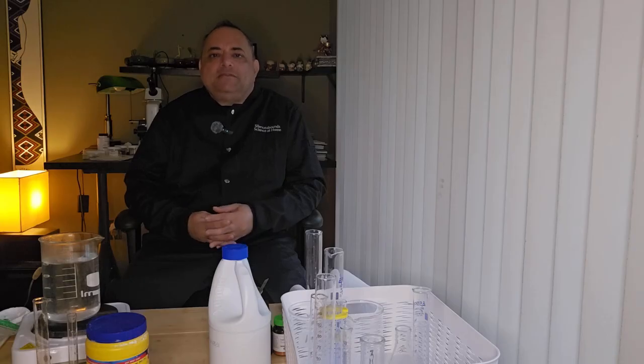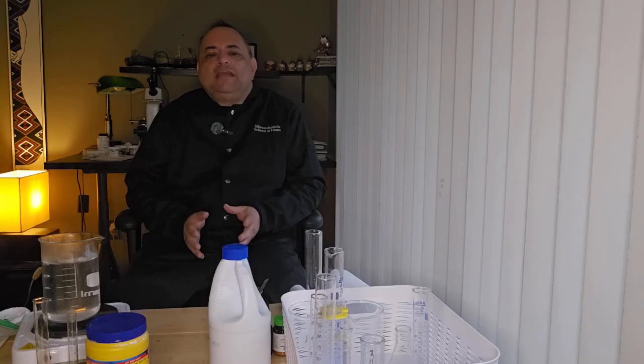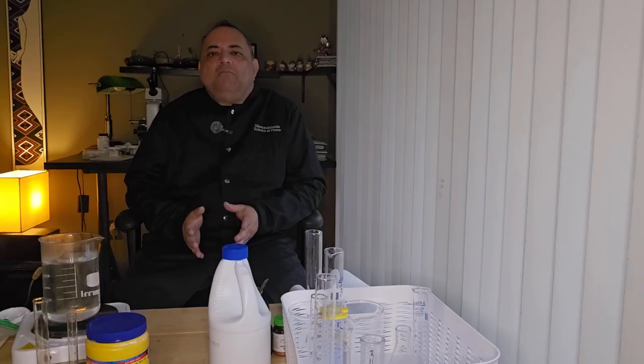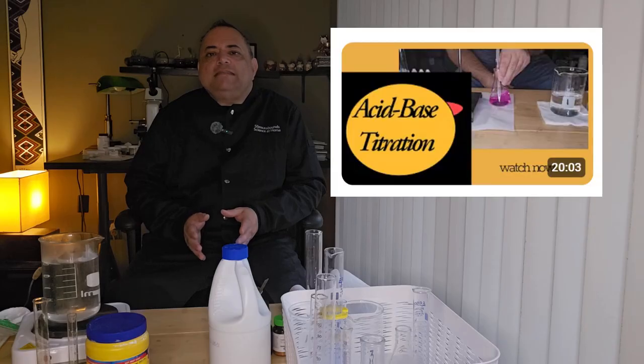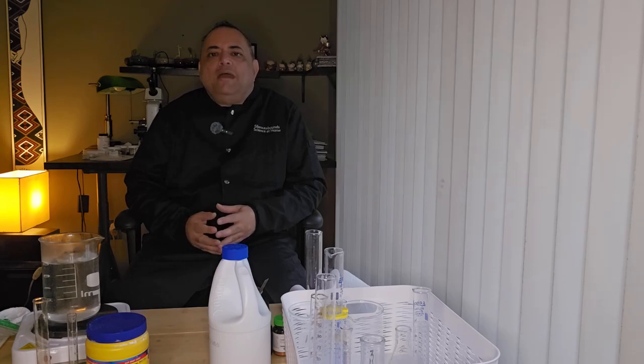In today's episode, I'm going to demonstrate the technique called iodometric redox titration. And we're going to use this titration to determine the percent concentration of chlorine in household bleach. Please check out my previous video dedicated to acid-base titrations, where I went into more detail on the technique of titration.